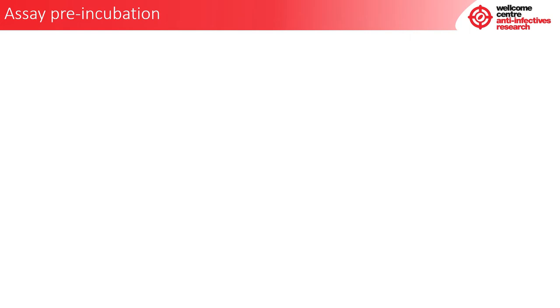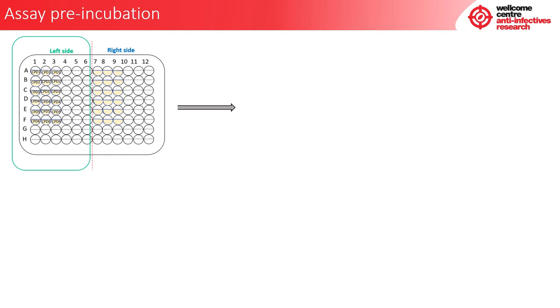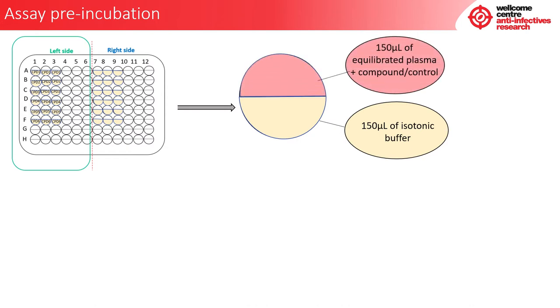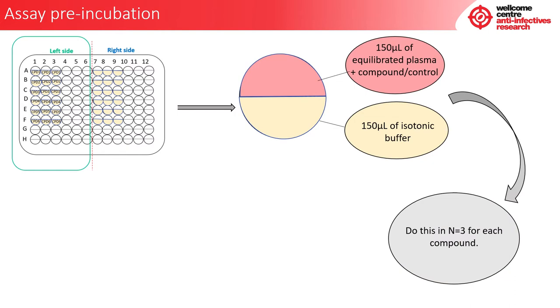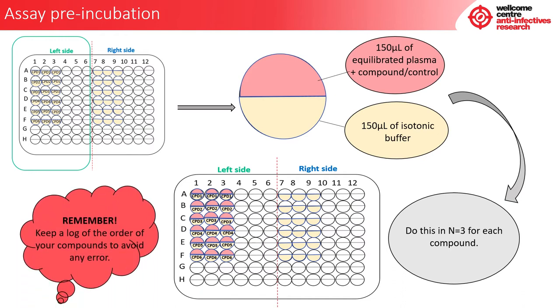Now we are going to carry out the assay pre-incubation. On the left-hand side, also known as the sample side of the dialysis block, we have 150 microlitres of isotonic buffer in the bottom chamber of each well. Into the top chamber of each well we are going to add 150 microlitres of equilibrated plasma and compound or control into the appropriate wells, in an N of 3 for each compound. For example, A1 to A3 is compound 1, B1 to B3 is compound 2, and so forth. Remember to keep a log of the order of your compounds to avoid any error.